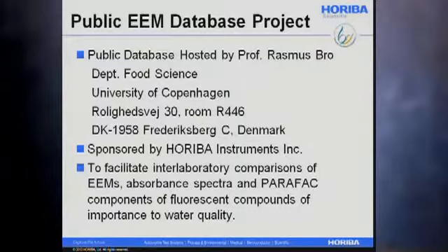One of the things I want to talk about that's another very exciting development is there's going to be a fully validated public database of excitation emission matrix data and parafac and absorption spectra, hosted by Professor Rasmus Bro of the Department of Food Science, who's actually the author of the PLS toolbox for MATLAB and a number of other multivariate packages.